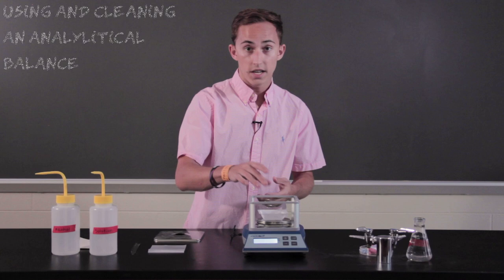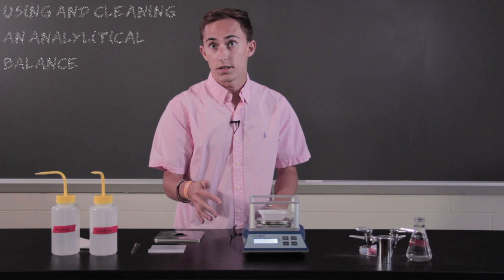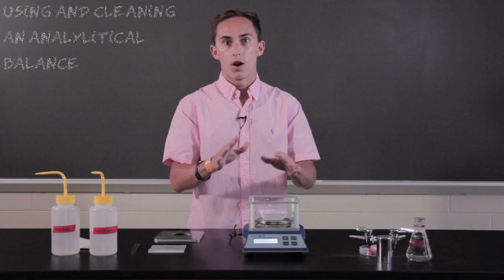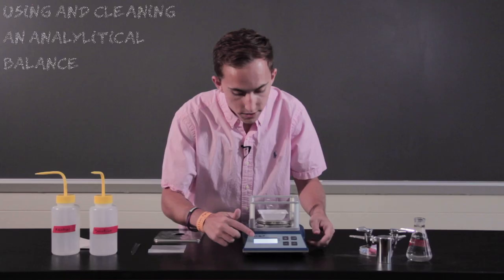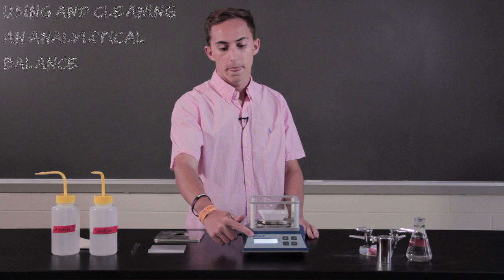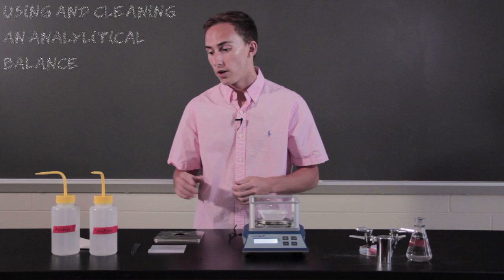Now notice, even though it is very light, it still has a weight. And what we don't want is this weight to be in our weight of the sample. So you're going to press tare here, and it's going to put it to zero. That means that whatever else you put in the weigh boat is going to be weighed, but not the weigh boat itself.